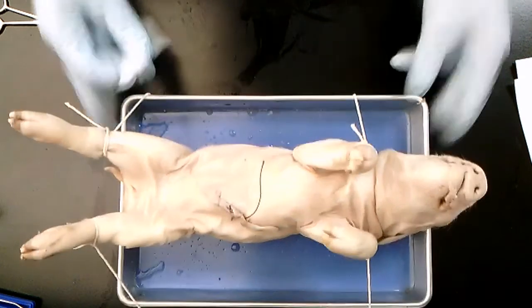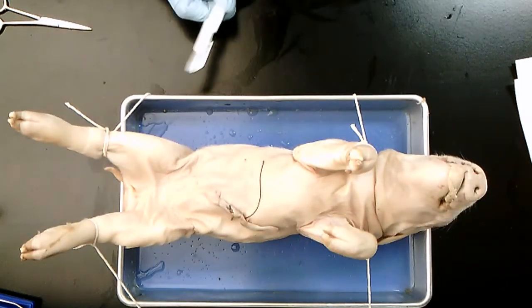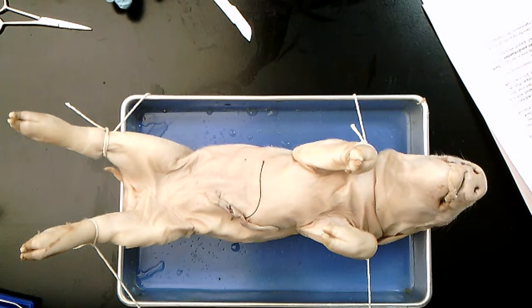So one of the areas of identification on the fetal pig is the mouth cavity. I have a document that I'm looking at, and it actually gives a step-by-step procedure of how to do the dissection in both the mouth cavity and the abdominal cavity.